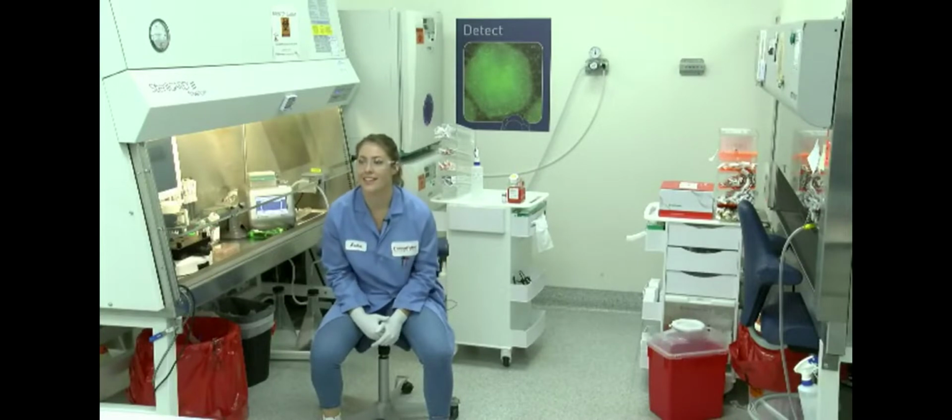Now maybe going a little bit more in terms of protocols for the Neon. Are there any specific protocols that you could use for pluripotent stem cells, or would we have to optimize for every single pluripotent stem cell line that we have? So for most cell types, the recommended protocols are described in the Neon Cell database. So it's likely that you would be able to find your iPSC line in the database. If it's not in there, you can identify the cell type in the database that's most similar to the one that you're using, and that's a good starting point to do your own optimization from there, and you don't actually have to go through the full 24-well optimization, but that is an option as well.